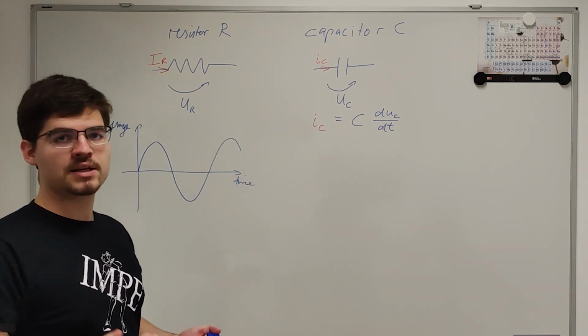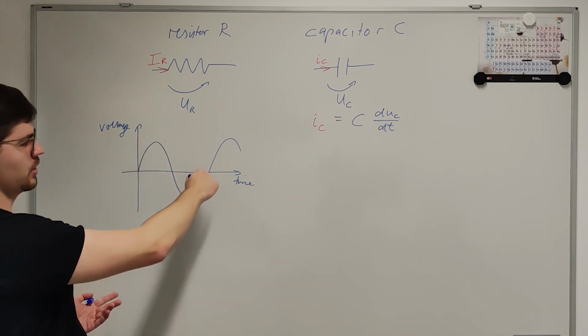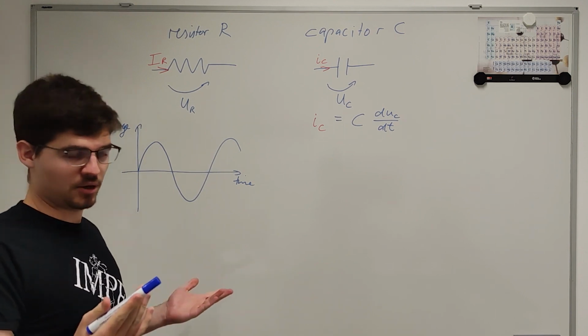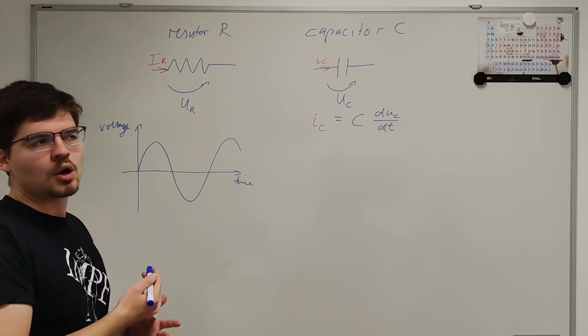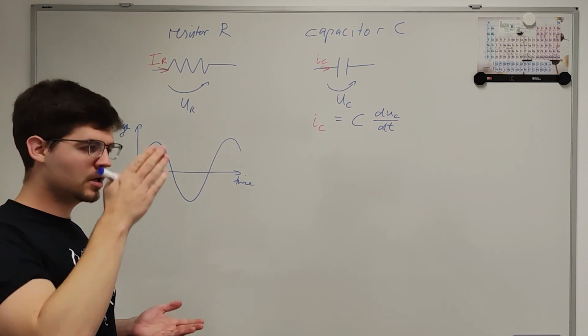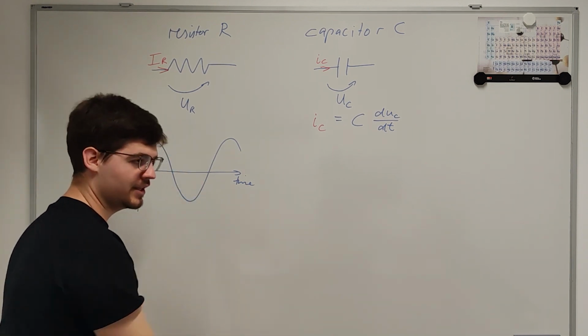What I've plotted here is this excitation waveform. And what we're doing is a sinusoidal voltage. Now, for the resistor, we're familiar with this now. The current response of such a thing is again just proportional to the voltage. And no other shifts or any such modifications occur. It's basically just changed in amplitude and qualitatively the same.